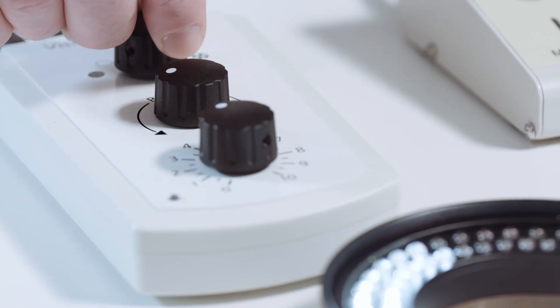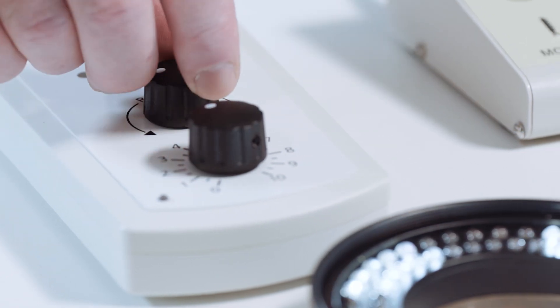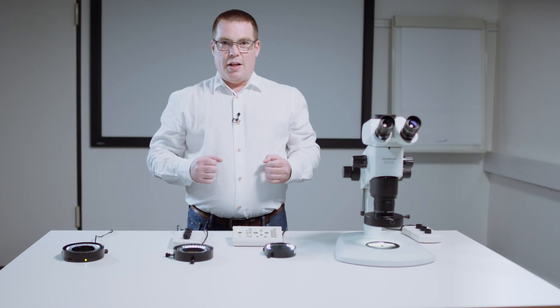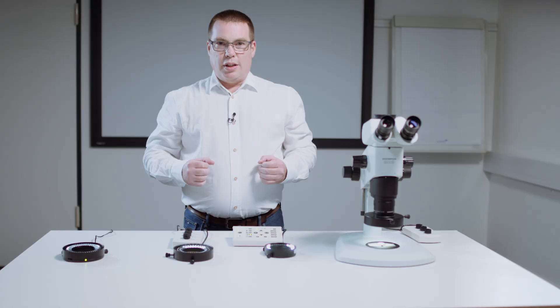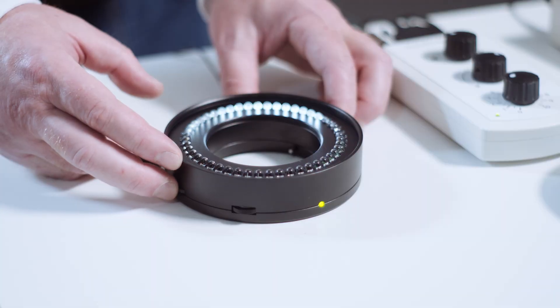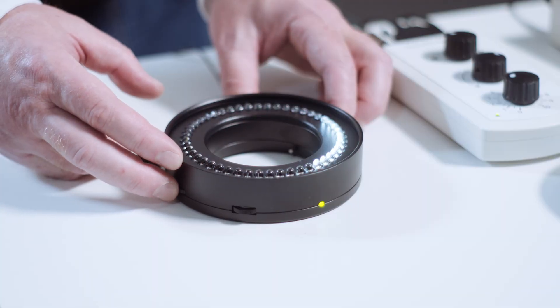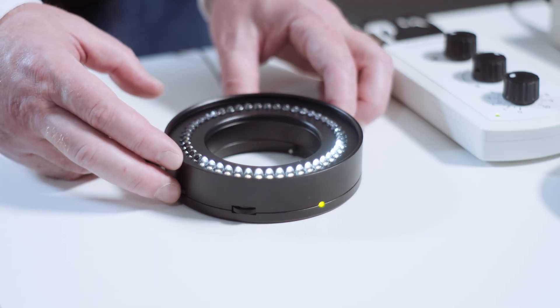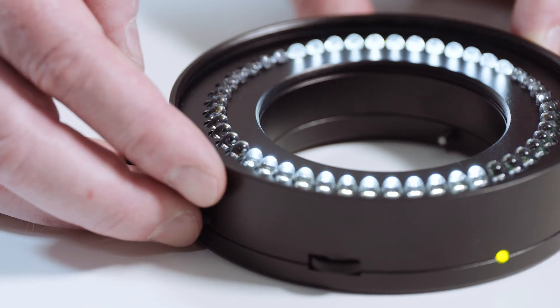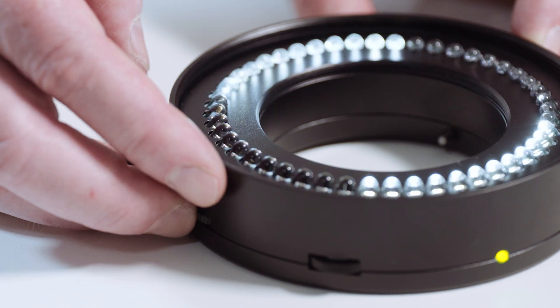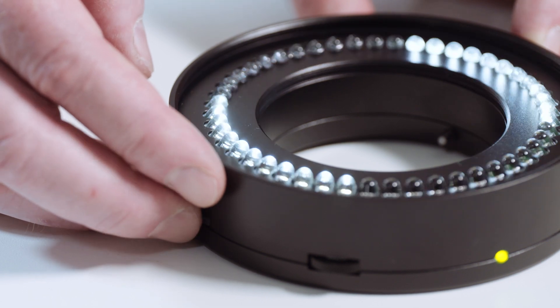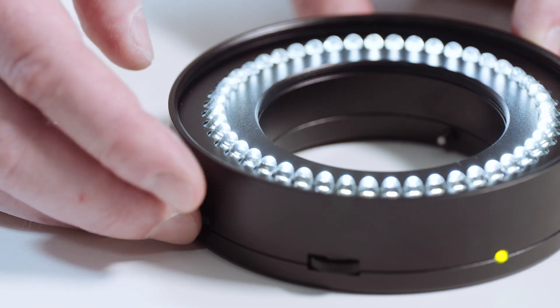The segment modes are selected either via the controller for the VZLED series or directly at the ring light of the EZLED Plus. The latter offers the advantage of not having to look away from the eyepieces.